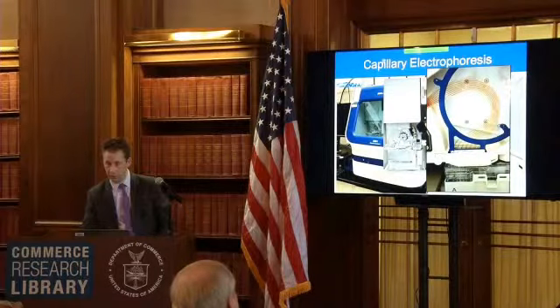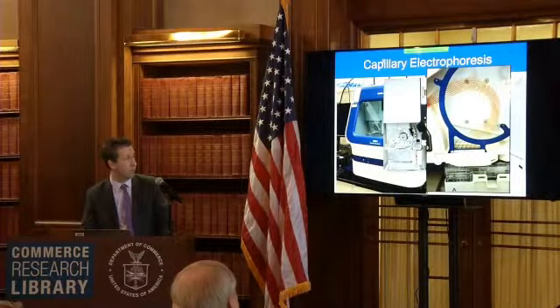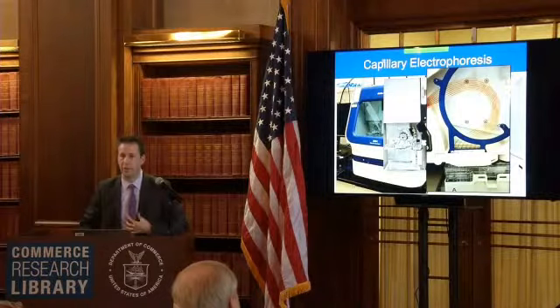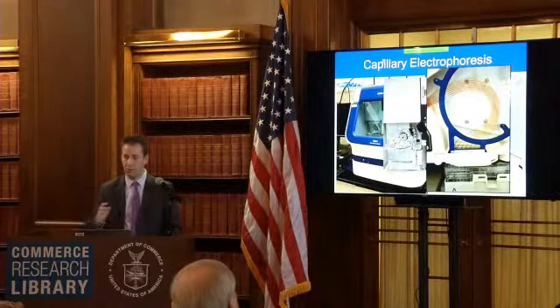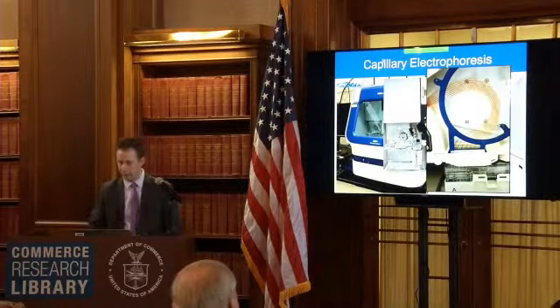So here's an idea of what these look like just a little bit closer. This kind of instrumentation was commonly used in the 90s. It's still used today for sequencing of the genome, but also this is what we're calling fragment separation, looking at these PCR fragments.